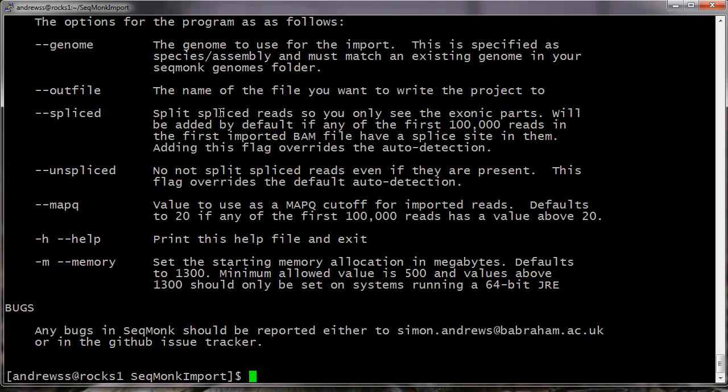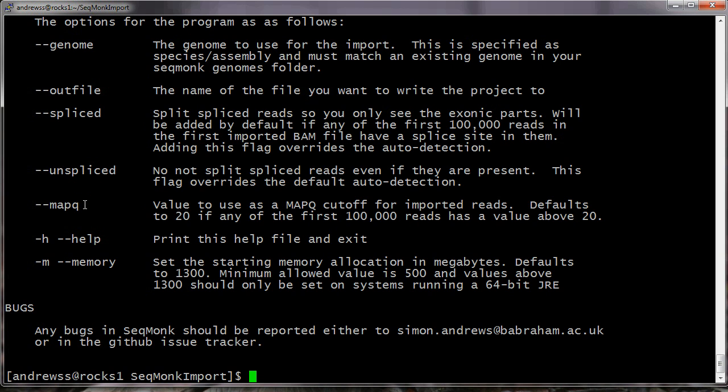It also applies a MAPQ cutoff filter by default, so again the default is a value of 20, but you can modify that. The same thing is true in the non-interactive importer. If you don't specify anything, you'll just get the defaults that you would have got in the interactive application, but you can specify --spliced or --unspliced to force the splicing behavior when importing, and you can specify --mapq and a value to set the MAPQ cutoff value that's used during the import.